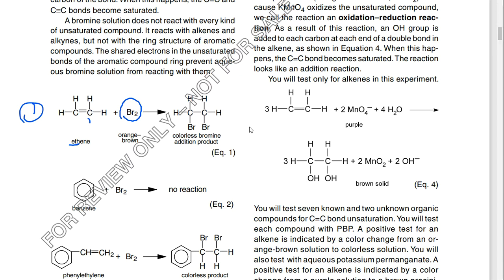This is a reaction that we've talked about in lecture, folks. When we went through this whole concept of what an alkene is, we followed that up with reactions of alkenes, and this was one of those reactions. If you remember, we added something like DCM as a solvent, and DCM stood for dichloromethane, or methylene chloride was the common name.